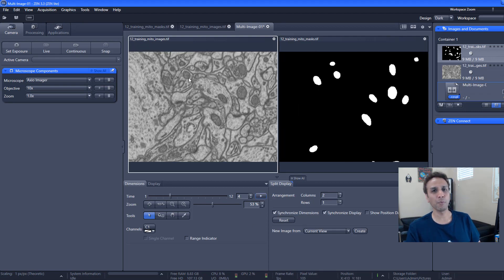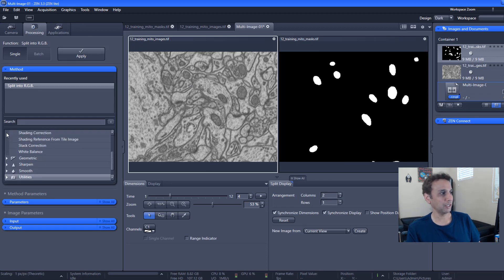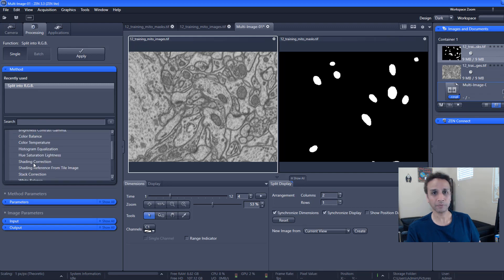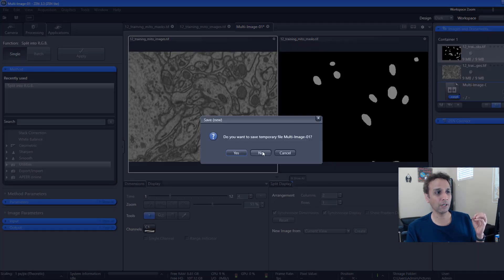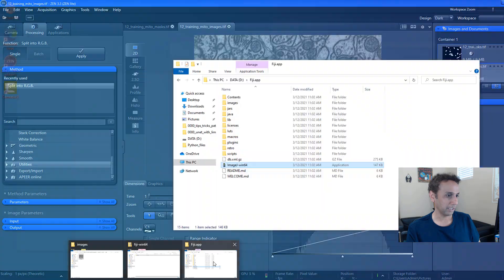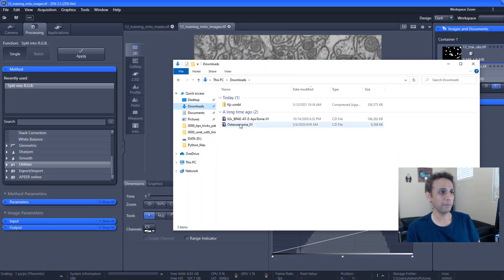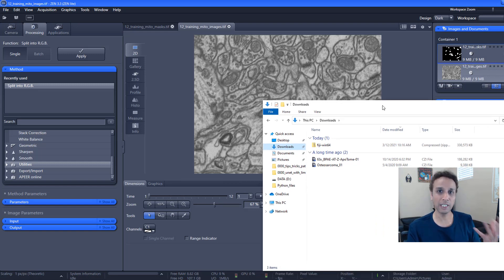There's a lot more you can do if you go to processing. Similar to ImageJ, for example if you have shading where one side of the image is bright and the other is dark, you can experiment with shading correction. There's also geometric correction, sharpening, smoothing, and many things. For more complicated images — I may have something in my downloads — yes, I have a couple of images in CZI format, which is the Zeiss format, but you can also have them in OME-TIFF or any other format that Zen supports.